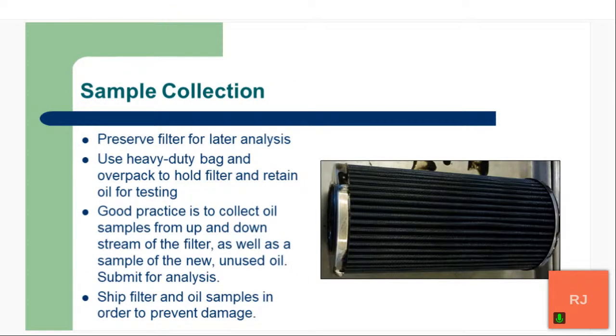So our sample collection, now that we've got the filter, we want to preserve that sample, as we mentioned, for the laboratory so that they're able to perform analysis on as much of the oil as well as the filter. So you should have a heavy duty bag and or an overpack that would be able to hold the filter and retain that oil for testing without contaminating it while it's being shipped to the laboratory.